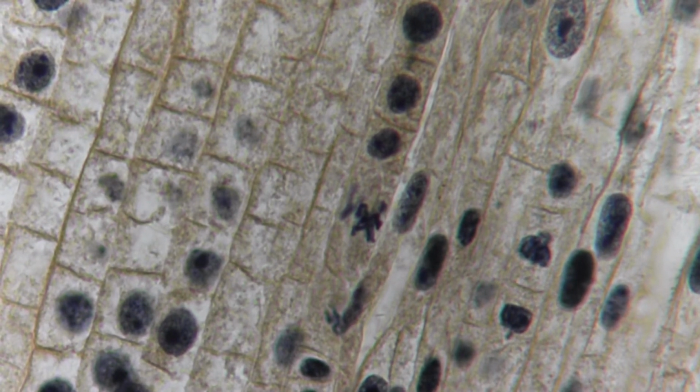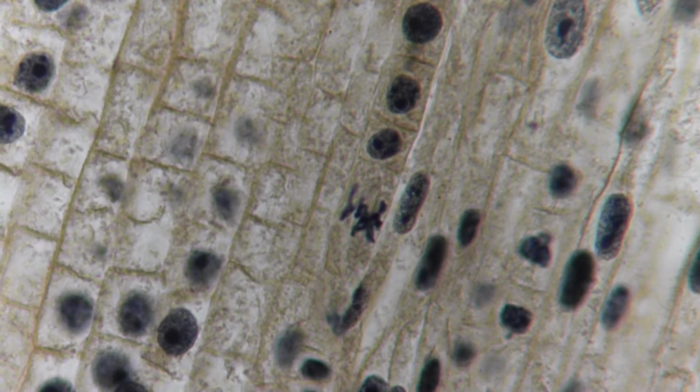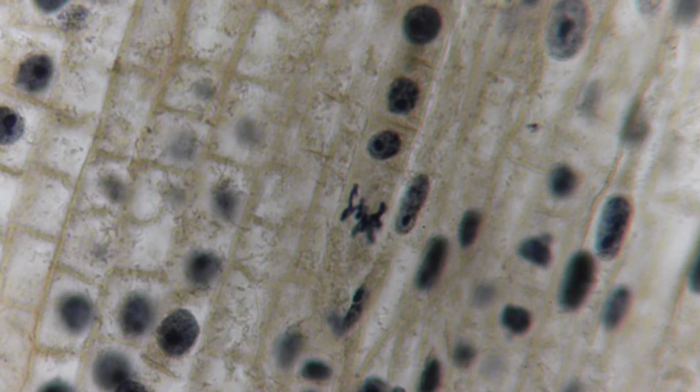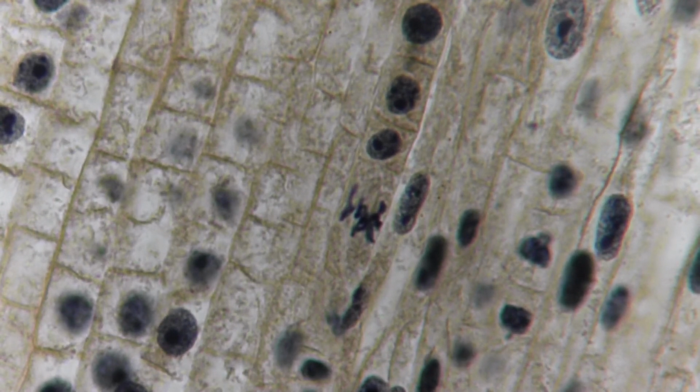Now the cell wall is not real distinct, it's rectangular. And I'm going to focus up and down on it because they're at different depths. And you see the kind of dark purple chains, and they're just kind of zigging and zagging across there.